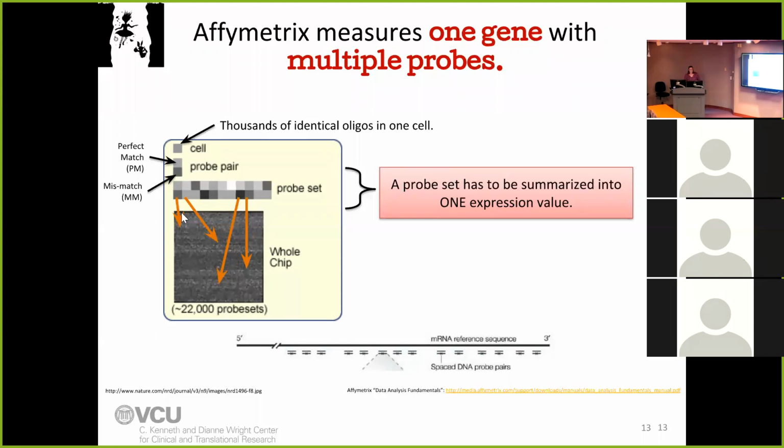These probe sets are actually scattered all around the chip, and what that does is help normalize out some of the noise. If the hybridization mixture didn't mix across the whole chip evenly, you're getting samples from the whole chip instead of just 1 location. And if that 1 location gets messed up, your whole measurement for that gene gets messed up.